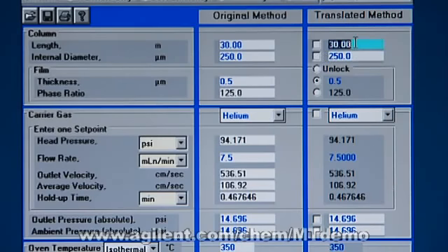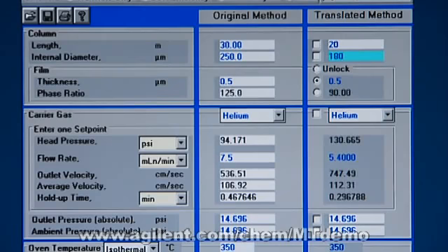And so I put in 20 meters, I put in 180 micron, or 0.18 millimeter ID, and now I don't want the same film thickness, I want the same phase ratio. If I click that over here to get the 125 phase ratio, now it tells me my new film thickness that I need in this column is a 0.36 film. So I know which column to buy to get the same results.